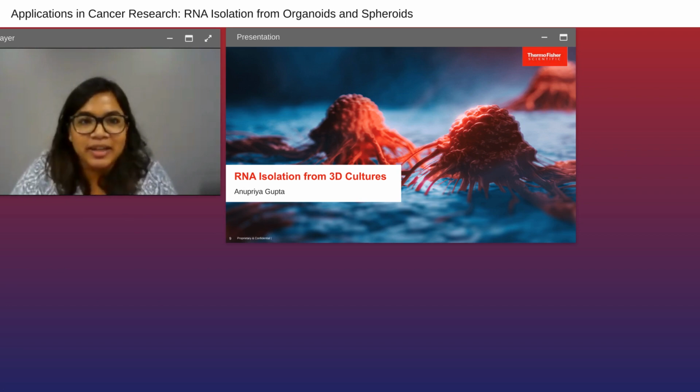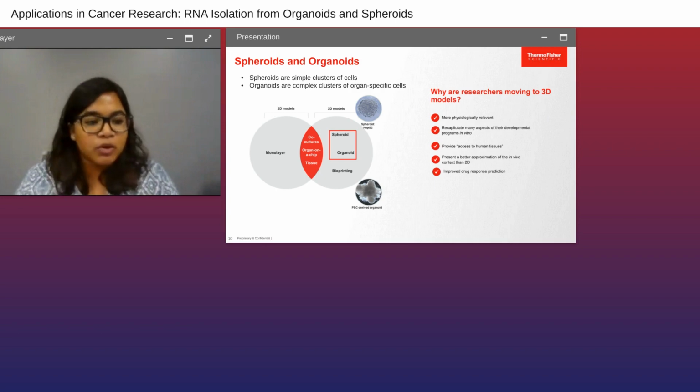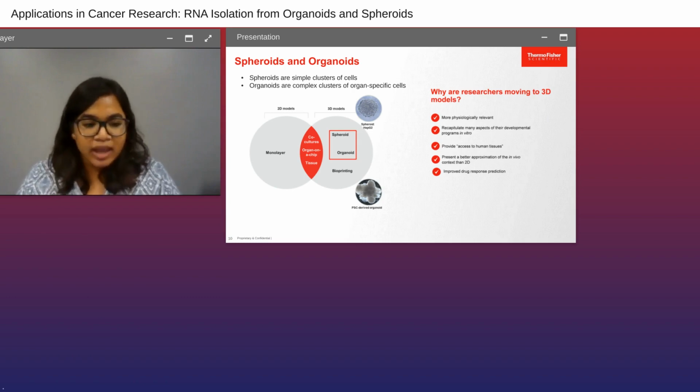I just wanted to talk a little bit about 3D culture and add to some of the things that Laura has already mentioned. So like she said, they present an in vivo picture for something that is in vitro. So we're able to grow organoids or spheroids from primary tissues or immortalized cell lines, and they resemble an in vivo pattern due to adhesion. That's their primary thing. Monolayer cells stick to the bottom of the plate, and 3D cell cultures, spheroids and organoids, generally stick to each other with adhesion. And the advantage over monolayer here is for cancer research, drug discovery, and toxicity testing.